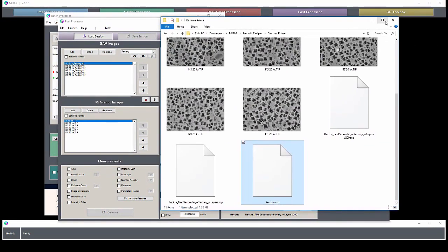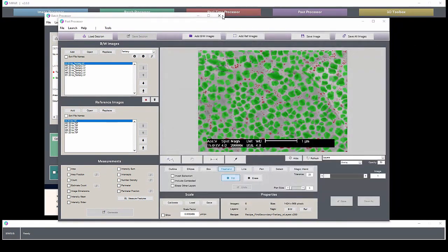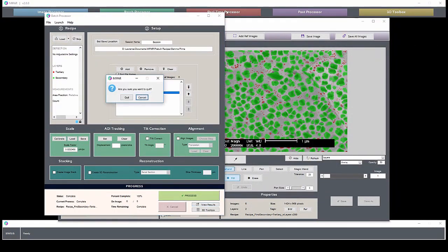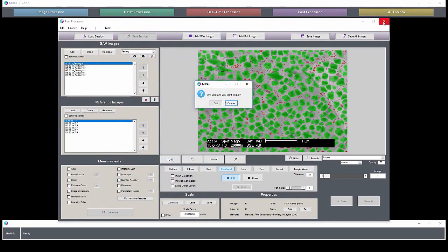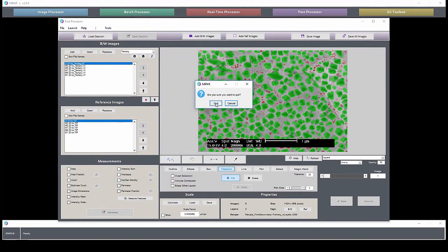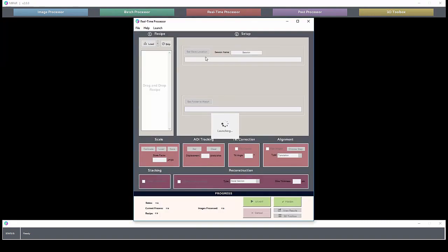The real-time processor looks exactly like the batch processor, except instead of loading images, you load the folder to watch, and it will execute the recipe on that folder.